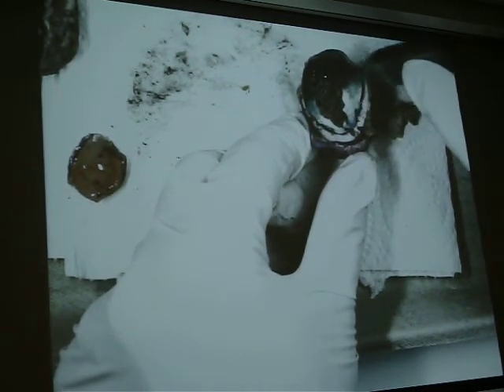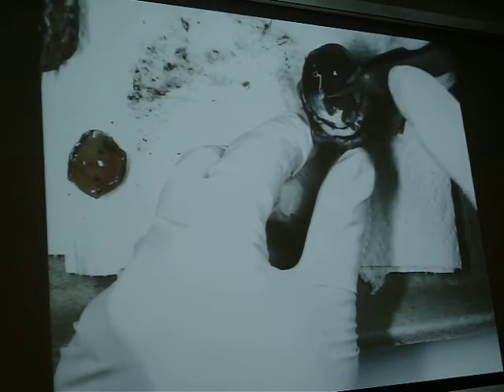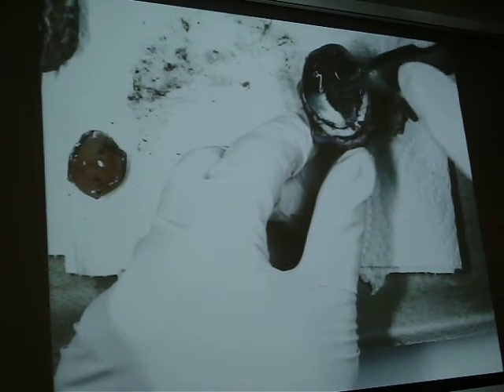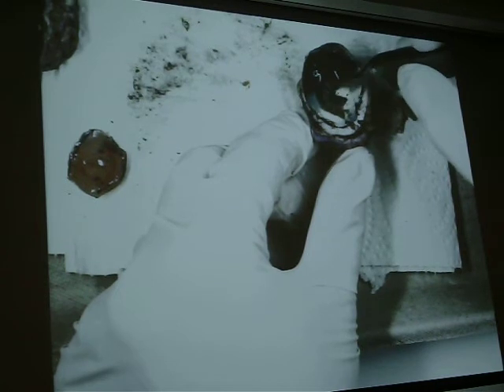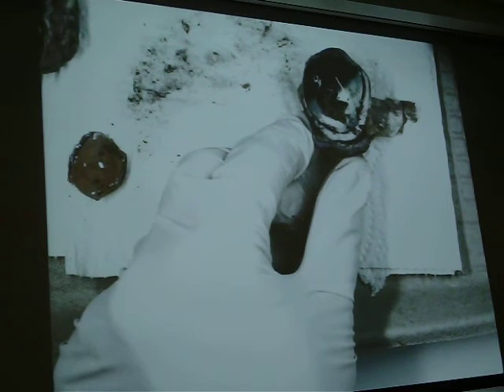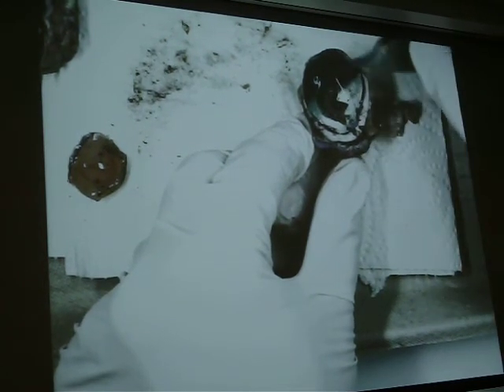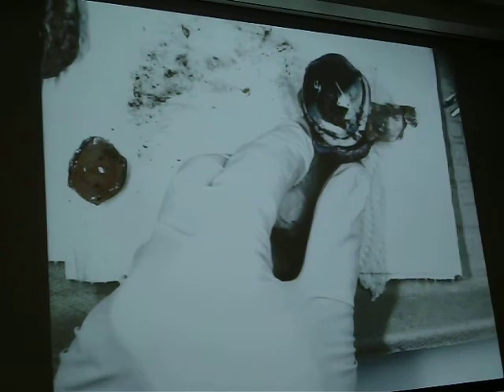If you're going to move the retina around a little bit, you'll see that it's stuck down at one particular point. And when I'm moving that — the point that it's stuck at — right there. That's where the optic disc is, this end of the optic nerve inside the eyeball. It's usually, or almost always, right on that junction between the black and the silvery-bluish color.